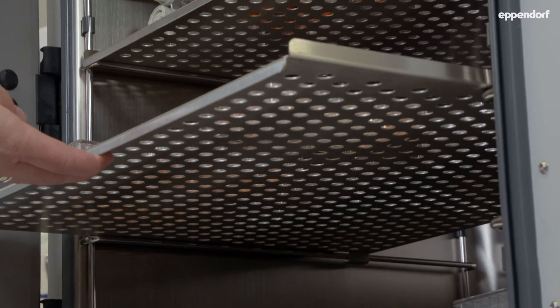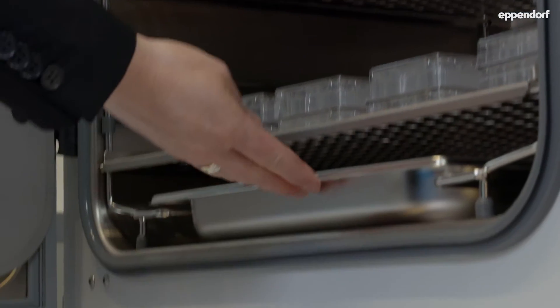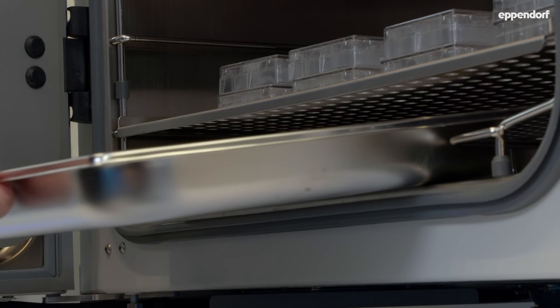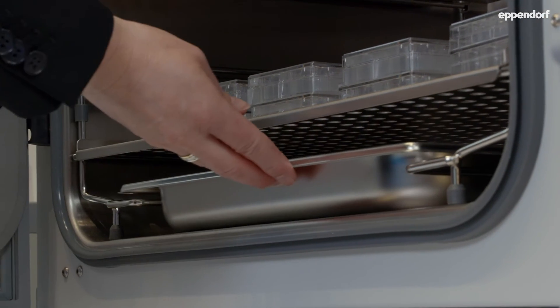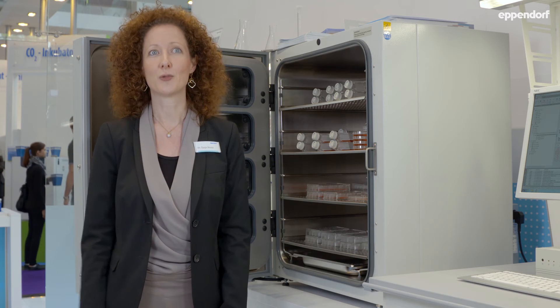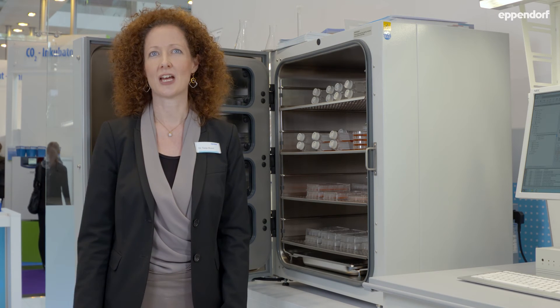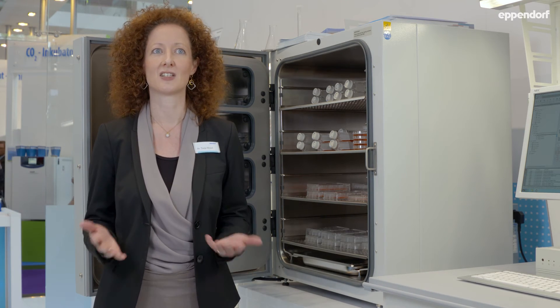Everything, but especially the incubator, should be easy to clean, for example due to an easy-to-disassemble racking system. The water in the incubator needs to be changed regularly. Make sure that you empty the water tray completely and disinfect it before you put in new sterile water. An automatic high-temperature disinfection mode can help in addition, especially if the chamber is not free of welds and seams.